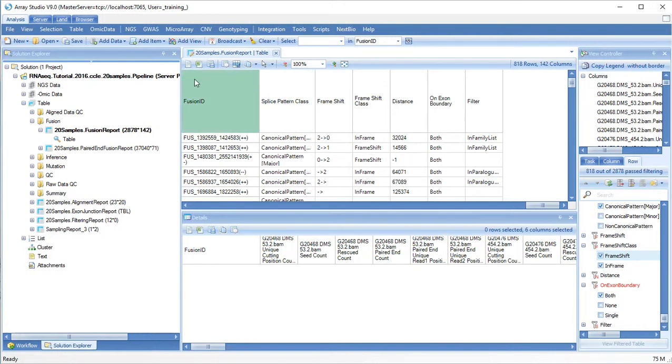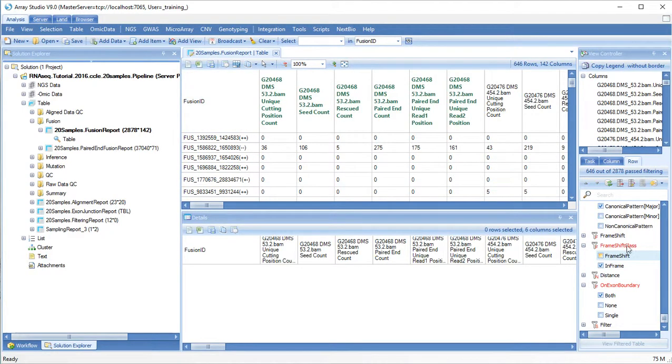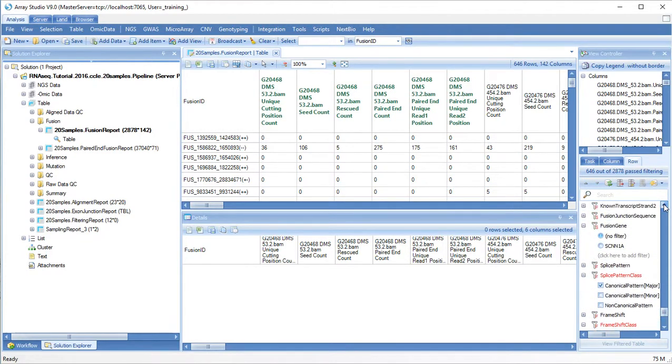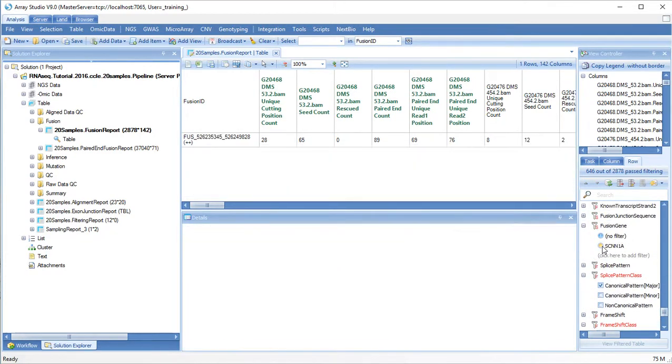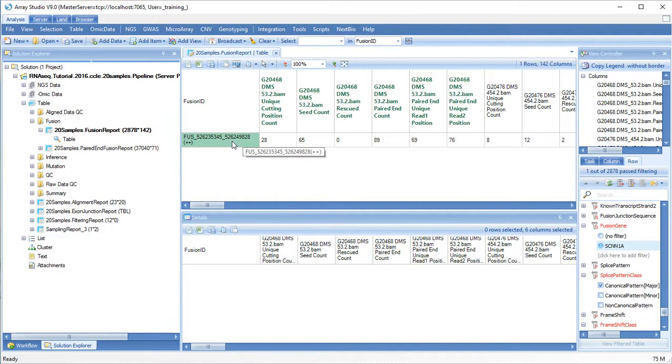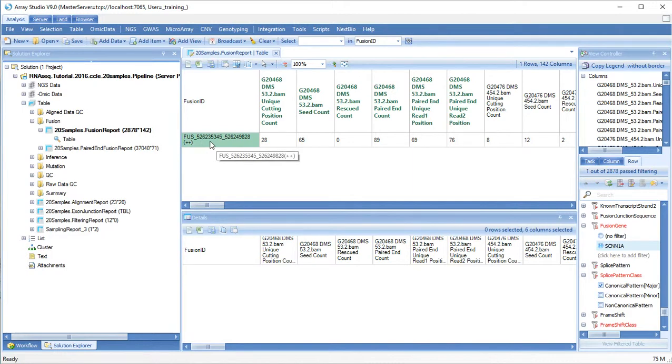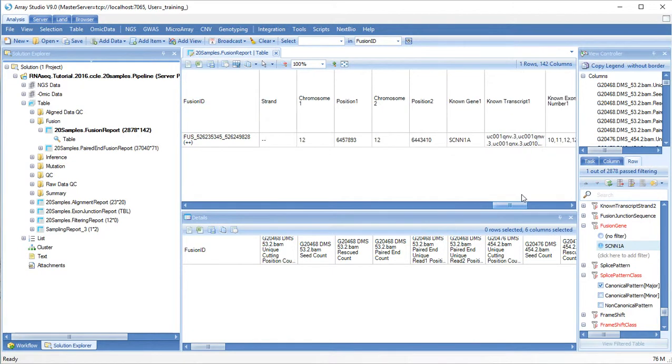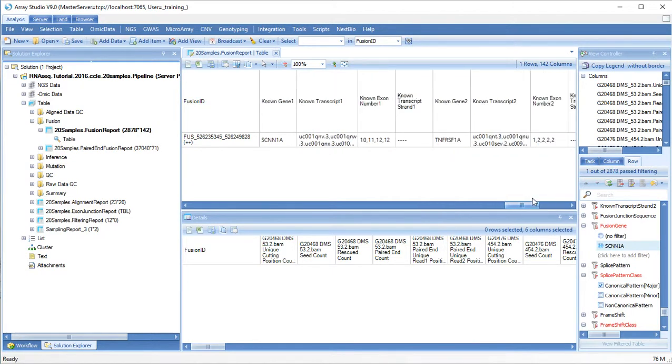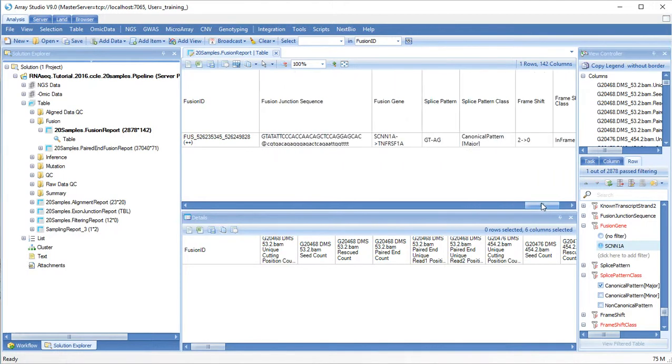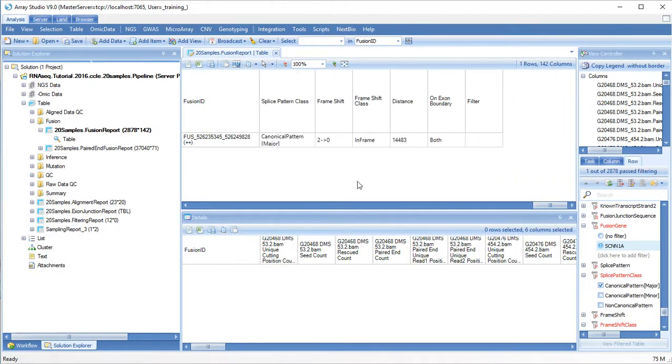Let's filter for the gene SCNN1A. We can see that 28 unique reads spanned this junction. In addition, 89 paired-end read pairs spanned from this region to this region. The start of the fusion is in SCNN1A and the end of the fusion is in TNFRSF1A. This is also an in-frame event.